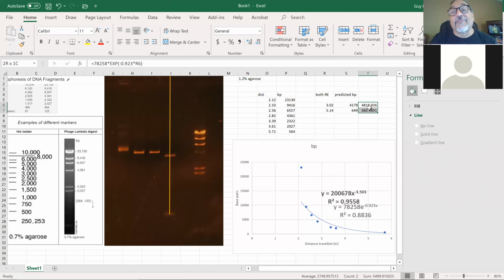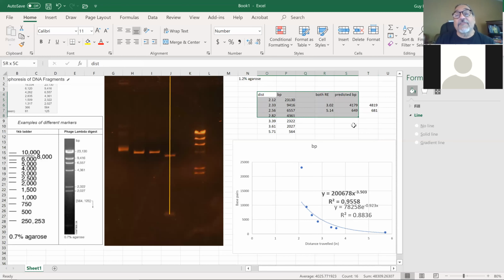So you can see the numbers are close, and they vary about where you'd expect. Now, we ran through this very quickly, and depending on how precise I was in drawing the lines, there are a lot of places where one might find error. But it's this entire piece that really is the end point: to be able to see that we're getting approximate base pairs as expected based on the sequence of the plasmid. Okay.